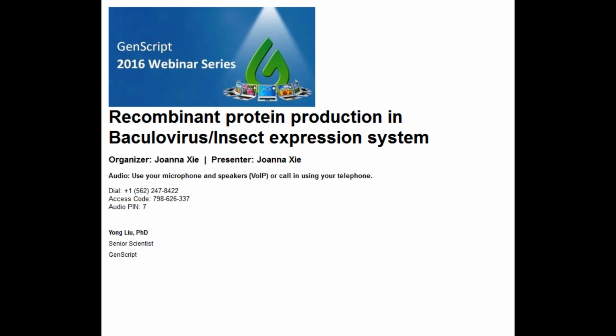Now this recombinant bacmid DNA is extracted and transfected to adherent Sf9 cells, and after about 3 to 5 days, the P1 baculovirus is produced right here, as you can see in the schematic. And then you could use blue-white colony screening to pick up the recombinant bacmid, and further PCR for identifying the right clone, as you can see in this gel image.